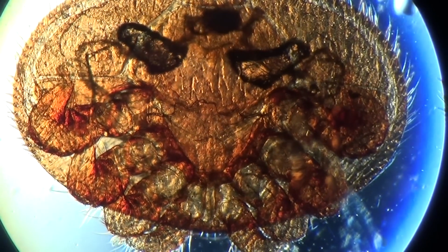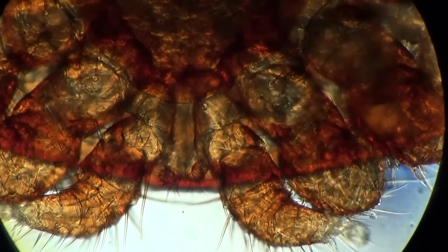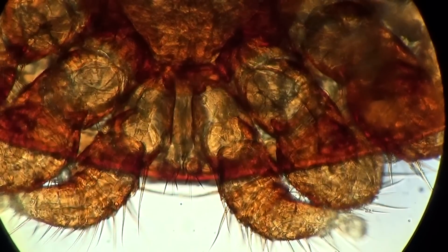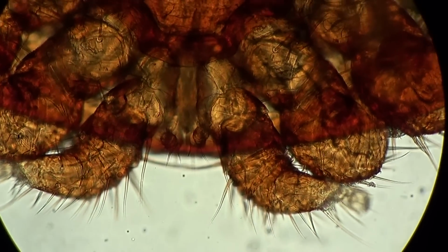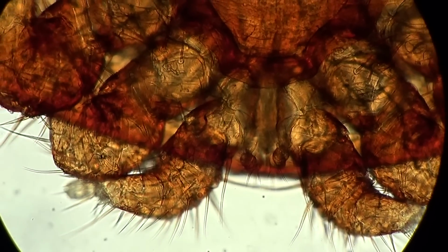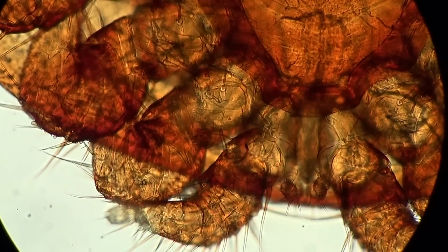Varroa mite, and we can watch a little bit more of the surface of this mite. So we can see its frontal part, you can see the sucking apparatus and some legs. These are 8 legs, so 4 pairs. The first larva has only 3 pairs of legs, and the deutonymph already has 8 legs.